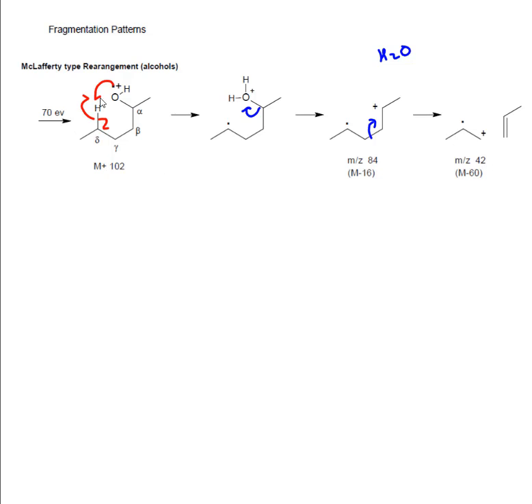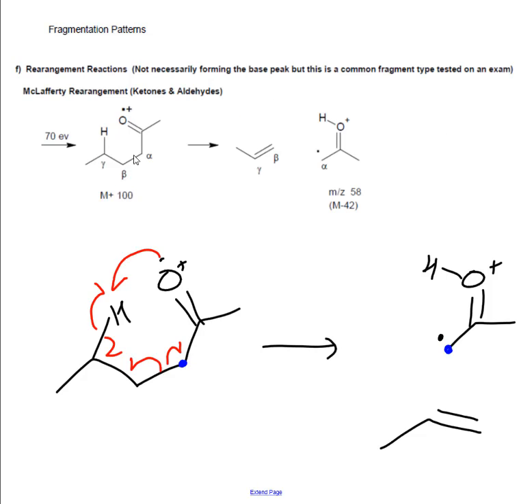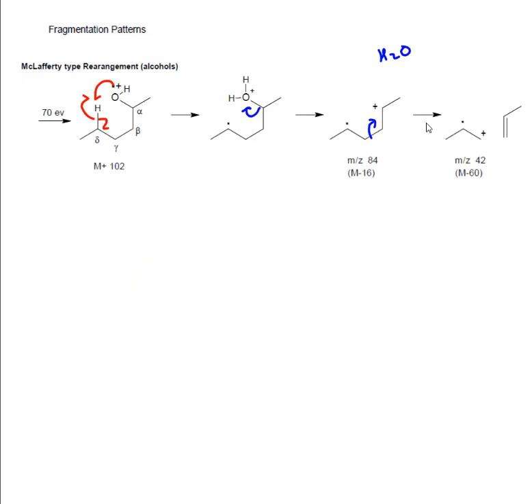So this is like McLafferty. If you learn McLafferty here and get the idea of this one, then it's the same concept, but obviously there's a little bit of a difference in the break at the end. They're both important, so I wanted to show them to you. All right, so that covers all of the mass spec review that I want to do.